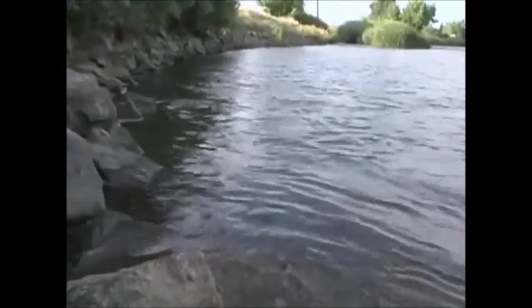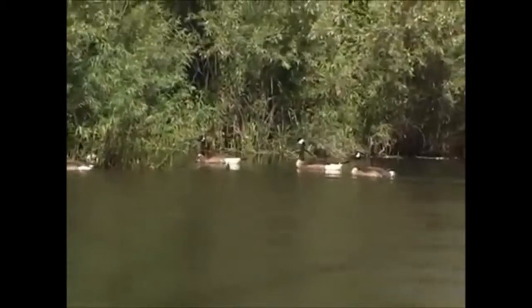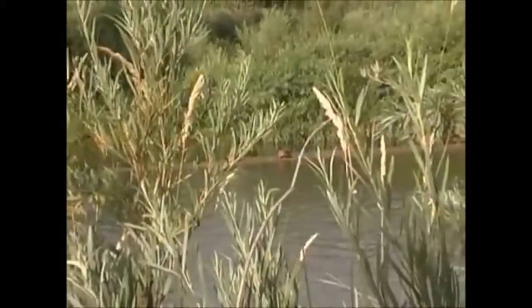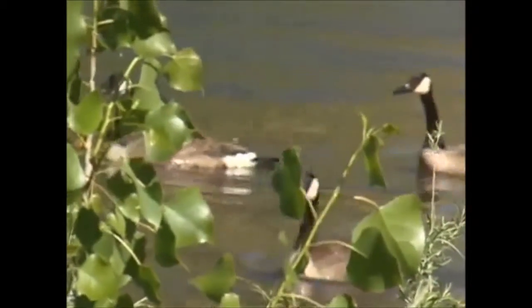Next is the test to determine how much dissolved oxygen is in the water. Dissolved oxygen, or DO, is related to temperature, since cold water holds more oxygen needed for aquatic life to survive. Low or fluctuating DO levels can harm the aquatic life.